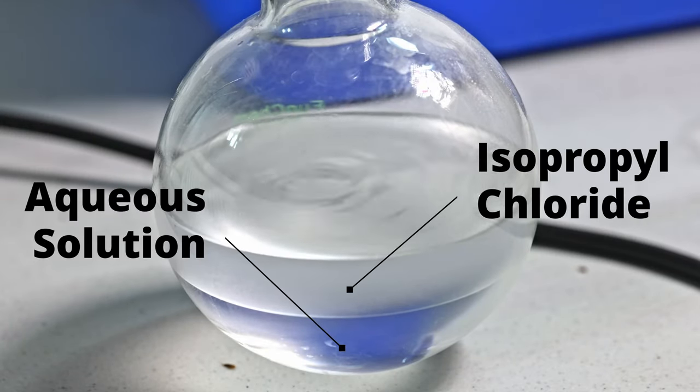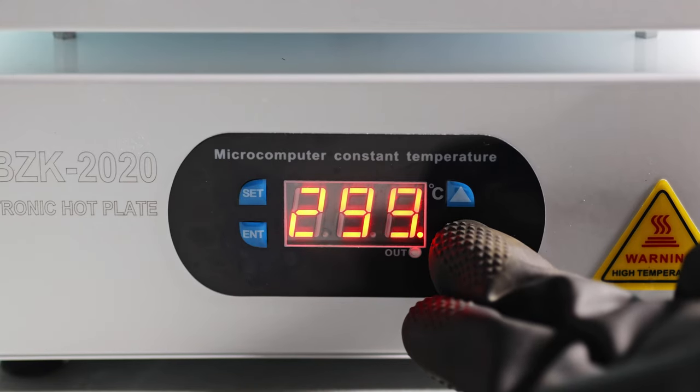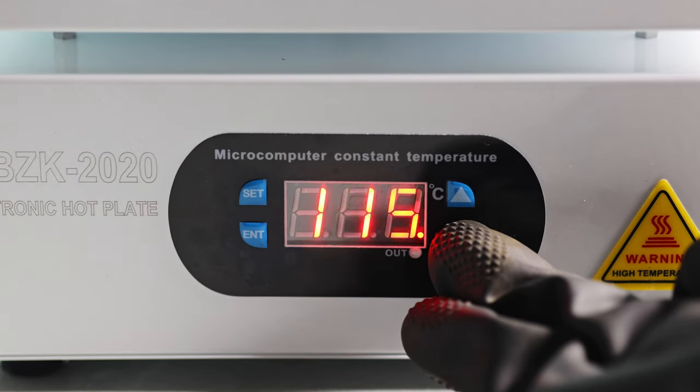As you can clearly see, we're getting more byproducts rather than isopropyl chloride. That means we have gotten the most isopropyl chloride we can get from this reaction. So I'm going to turn off the distillation and begin processing it.